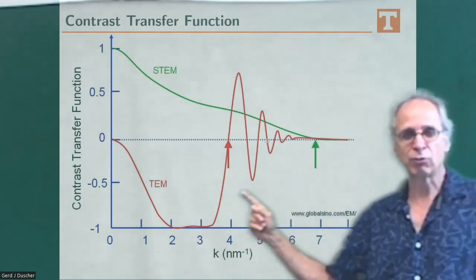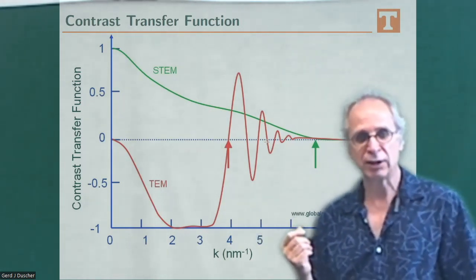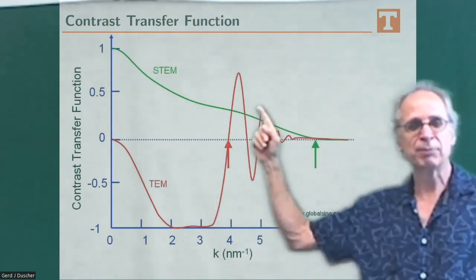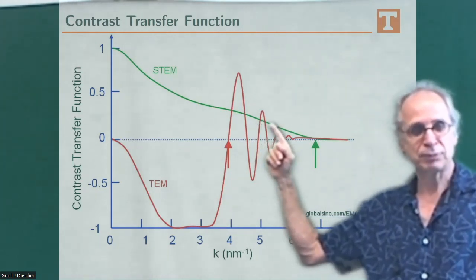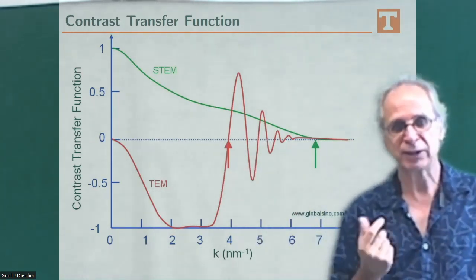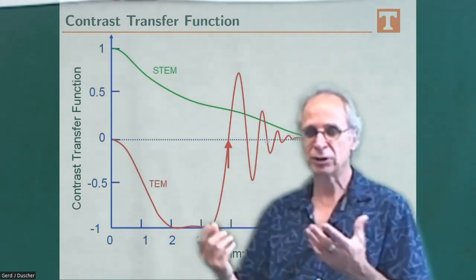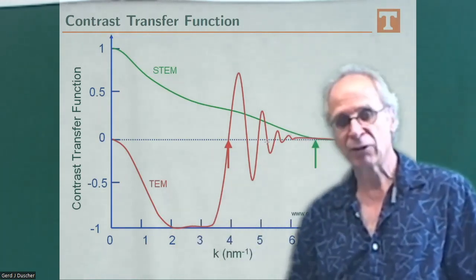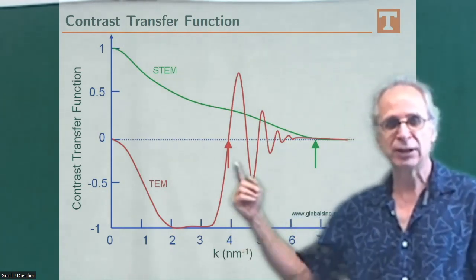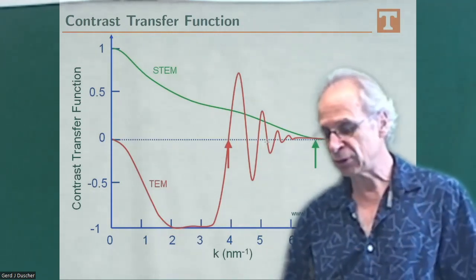Immediately, you can see that you have more resolution in a high angle dark field detector image than in phase contrast. Lord Rayleigh already determined that, so it's an incoherent scattering mechanism. And so the non-oscillatory part of the STEM is what makes it so convenient when you work on an electron microscope, because you know exactly where the atoms are and where not, and then you can determine your positioning. So they are a bit more naive to interpret, but if you want to know exactly the intensity your atom should have, obviously you still need to do some simulations, but for naive interpretation, we already said.